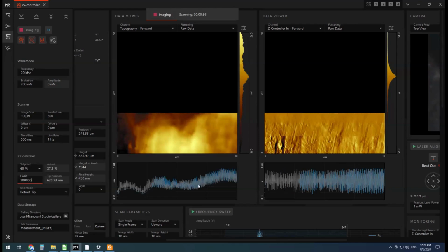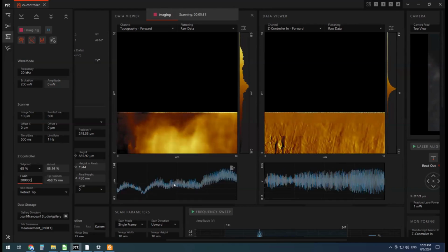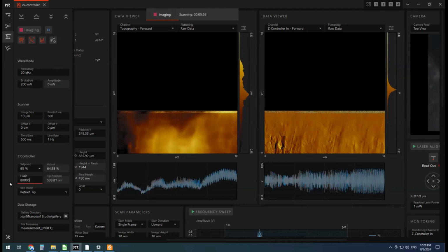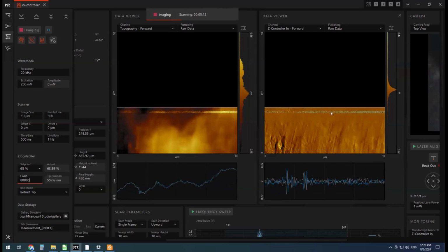200,000, let's try that. There we go. There's your noise. So that's really obvious. Sometimes it's a bit less obvious, but you can see how noisy this is. Take it back down to 80,000, I think was looking pretty good. Okay, and the noise goes away. Depending on the scale of your topographical image, it's a bit hard to tell the noise. But the Z controller in, or amplitude or error image, is usually a bit clearer.